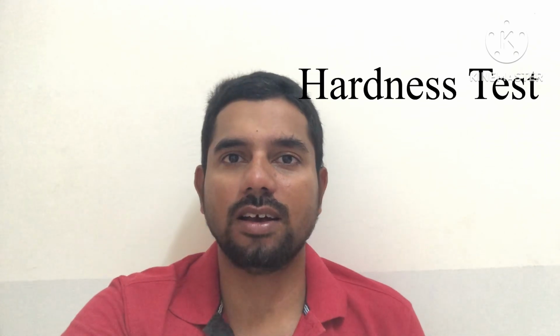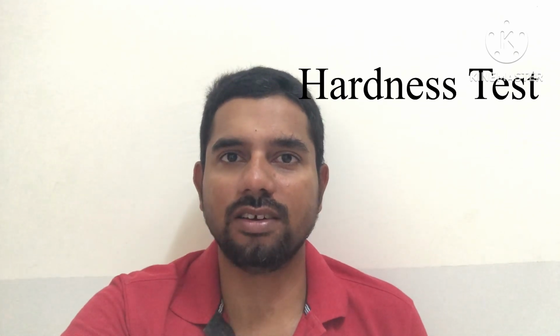Today I will discuss the main mechanical property, the hardness test, in industries, oil refineries, construction plants and all. How they are testing the hardness in the material, and what are the requirements to go through as a QC inspector or mechanical engineer. We know the basic things: what the hardness test is and where it is used, we have to know.